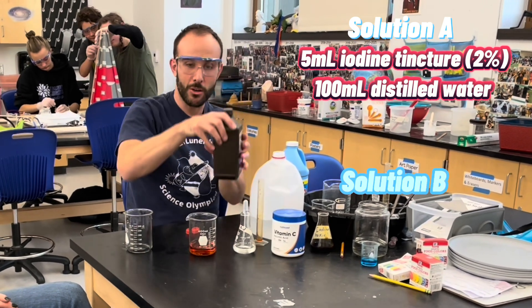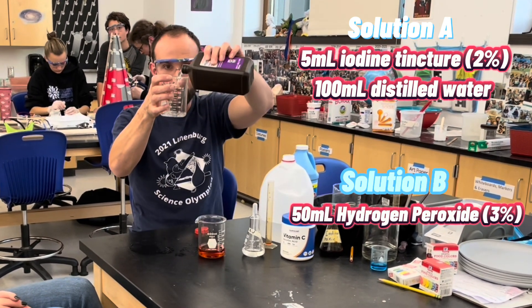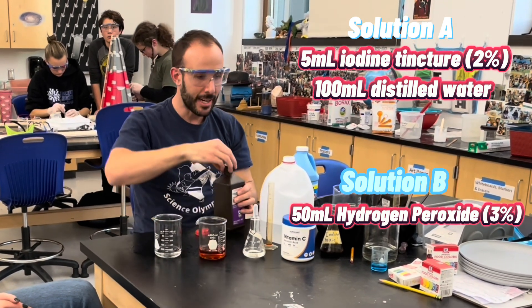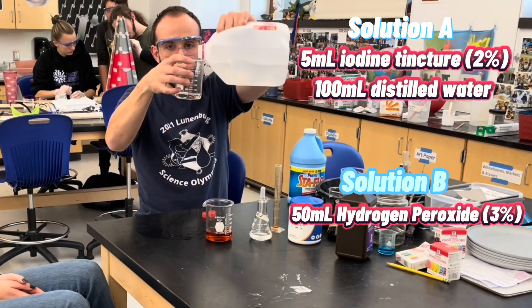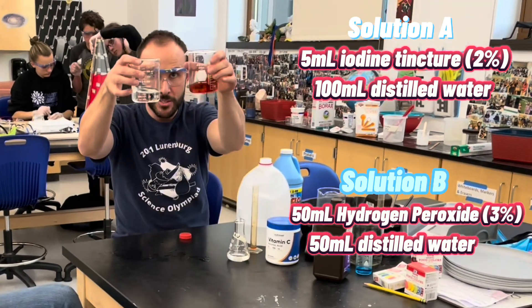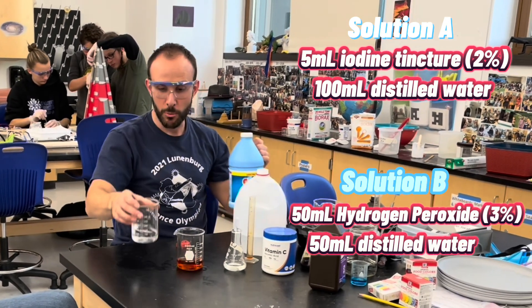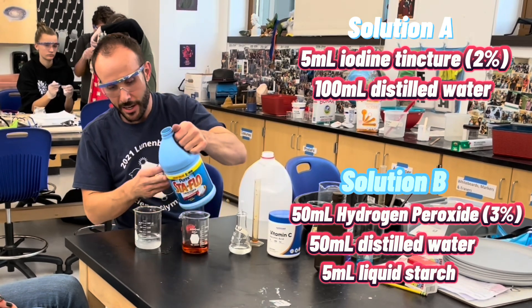Now I'm going to take regular over-the-counter hydrogen peroxide, and I'm going to put 50 milliliters of hydrogen peroxide in here. Next, I'm going to add some distilled water to top it off to about 100 milliliters. It doesn't have to be perfect, but I've got roughly the same amount of liquid in both. Now in the hydrogen peroxide one, I'm taking liquid starch and I'm going to put just a little bit of liquid starch in here.